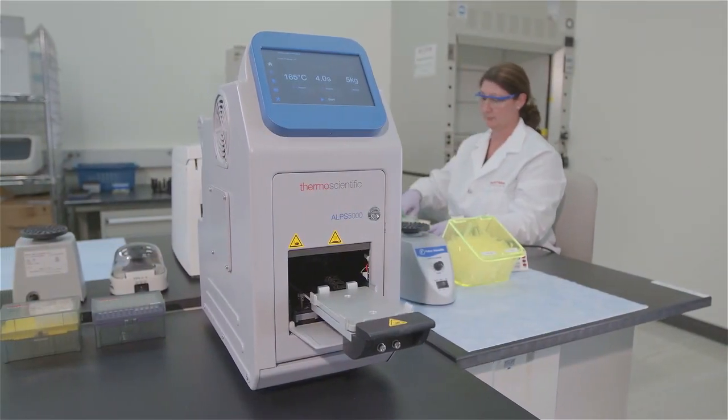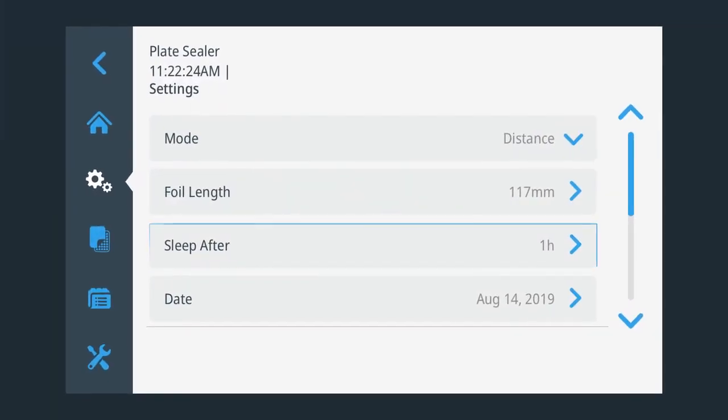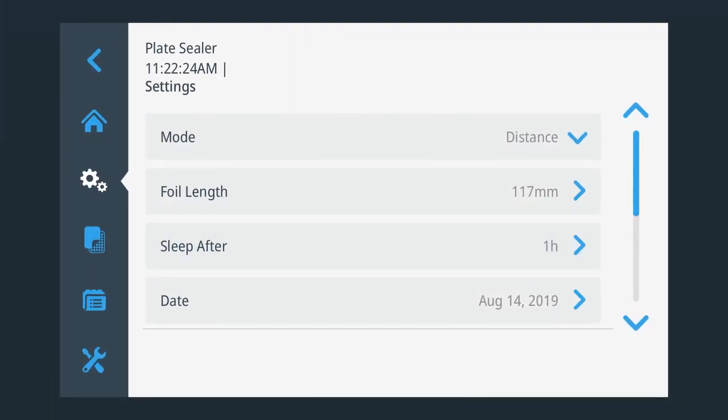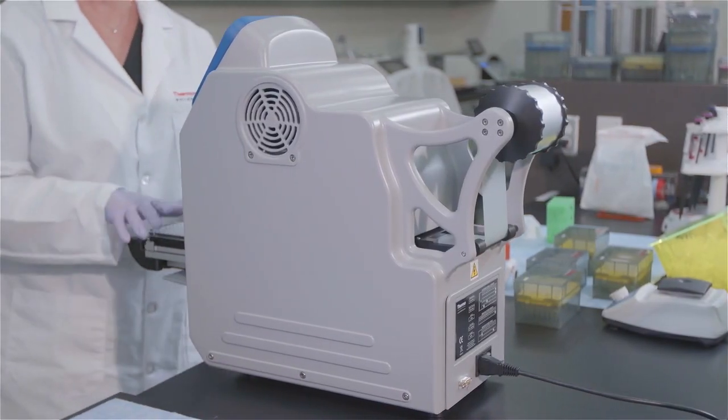To help save energy, the automated plate sealer enables you to set a time of inactivity, after which the unit will return automatically to default room temperature. To restart the heating element, simply touch the screen.